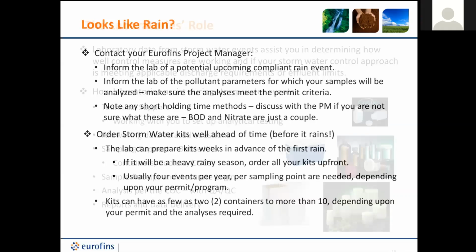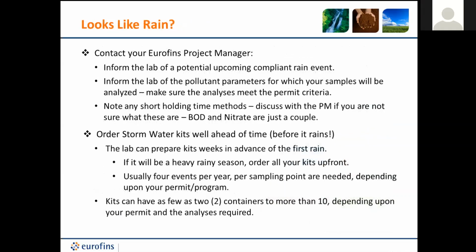Linda, this is Aaron. Yes. Quick question. We have a question on the chat. And the question is, do we need to request the lab to report J flags, or does it happen automatically?